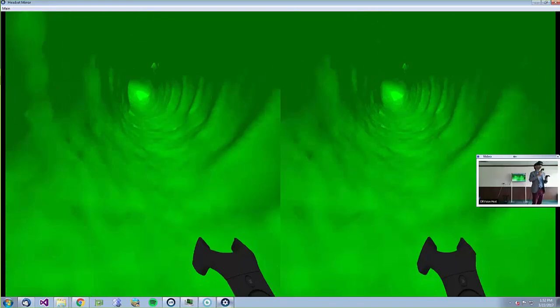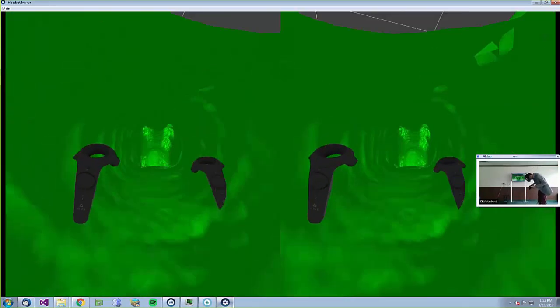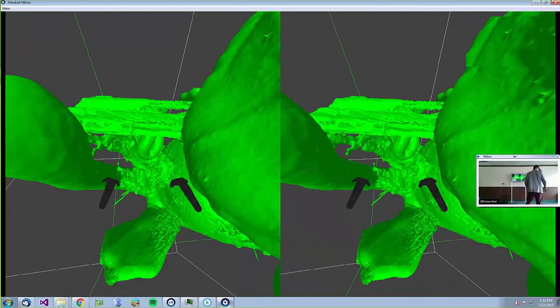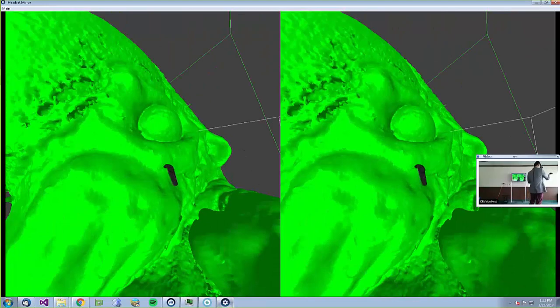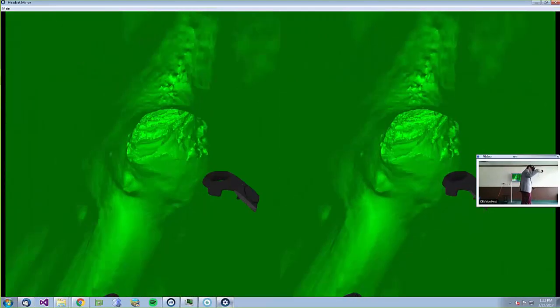I'm in his tail. Yeah. And if I zoom this out a bit, here is the tail, and there is the little guy. The eye and the hand, and we can also go inside here to see space.